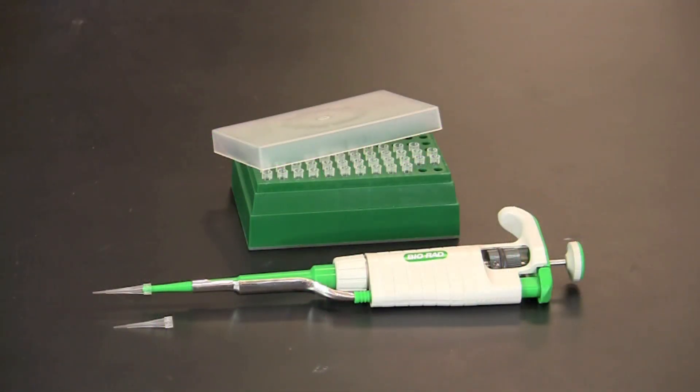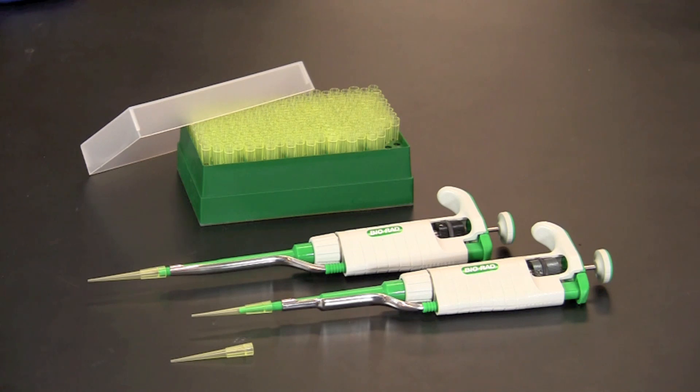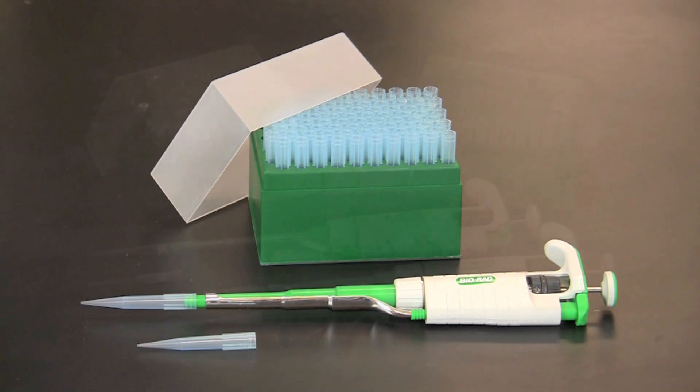The first step in using a micropipette is to make certain you are using the correct size and type of tip for the samples you will be transferring. Tips for general pipetting come in three standard sizes: the 0.5 to 10 microliter, tips that fit either a 2 to 20 microliter or a 20 to 200 microliter pipette, and tips that fit 100 to 1000 microliter pipettes.